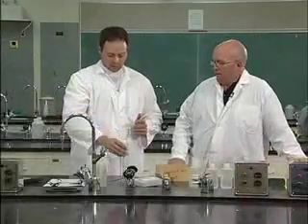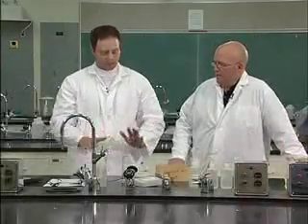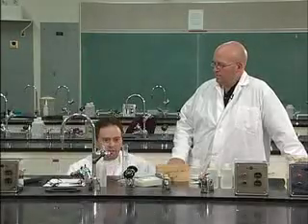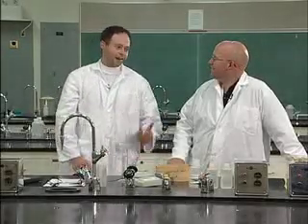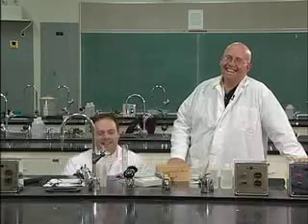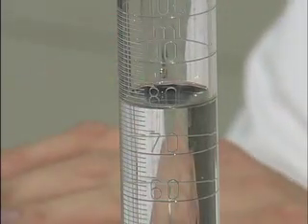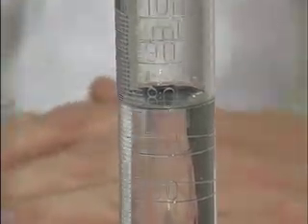Okay? And then you place the graduated cylinder back on a flat surface. Now, this next reading you're going to take is going to be your final volume. And what do you know, this one worked out great. I knew it worked out great before. But anyway, this one works out just great. If you take a look at my final volume here, it is exactly 80 milliliters. So that's why you picked that one. Yeah, that's why I picked that one.